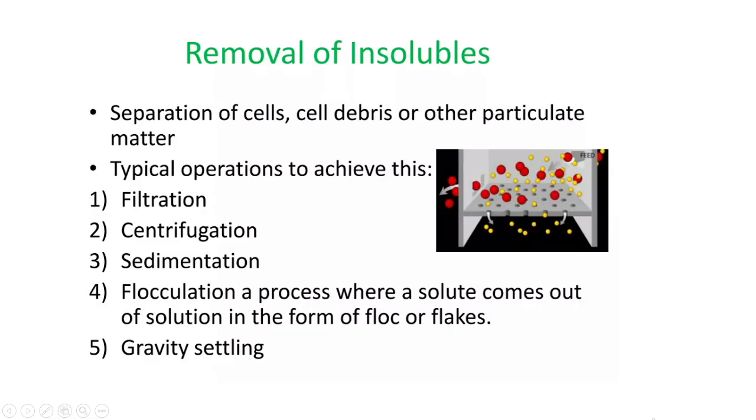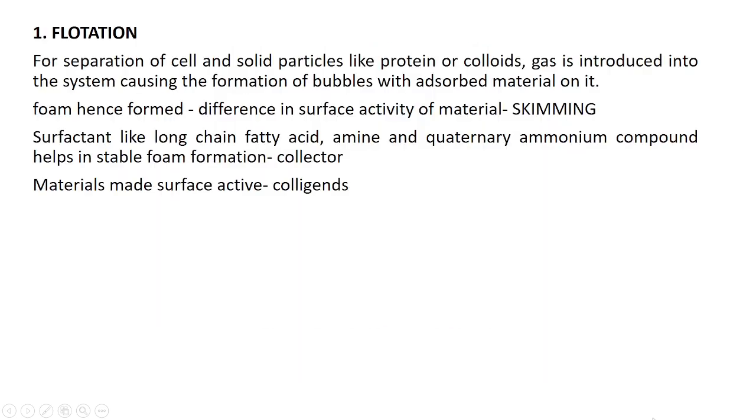We'll see each one. So the first step is removal of insolubles, removal of the solid particles. The solid particles mainly will be the cell debris and other particulate matter. And there are different approaches. You can use filtration, centrifugation, sedimentation, flocculation, gravity settling.